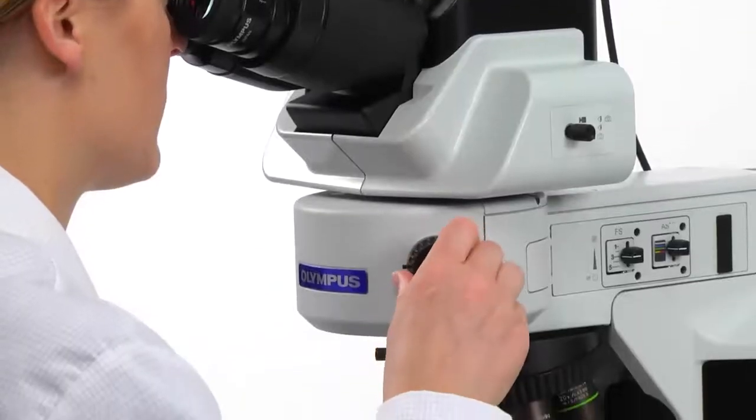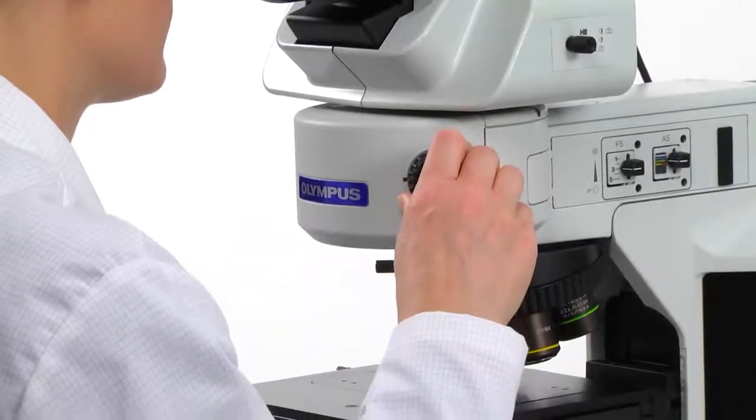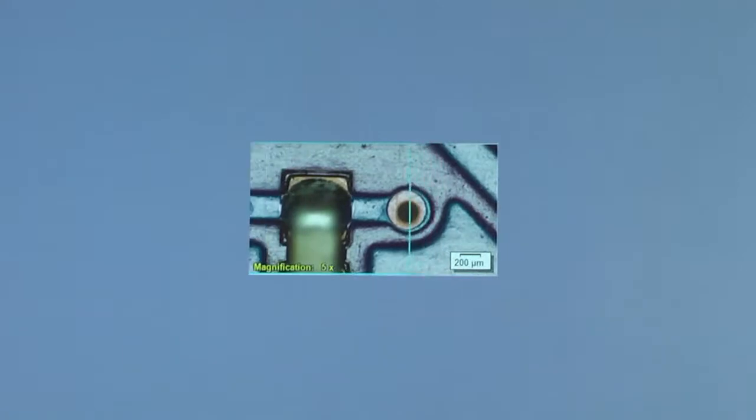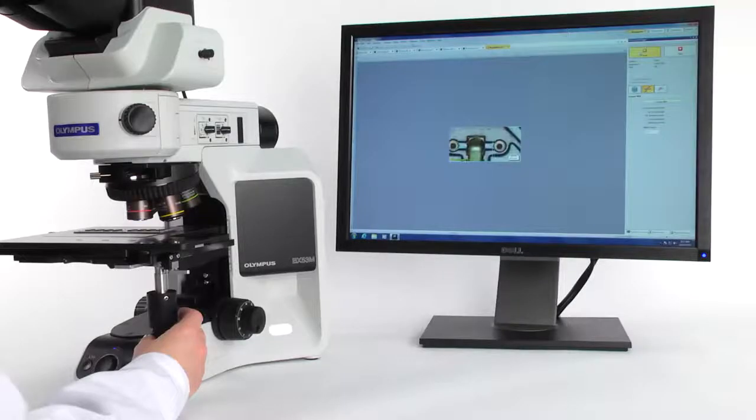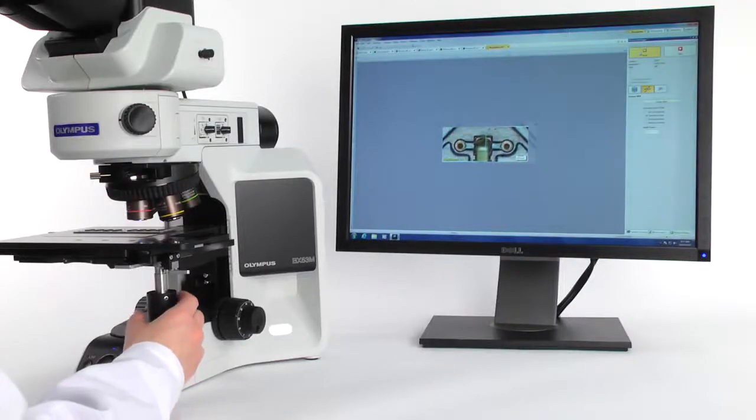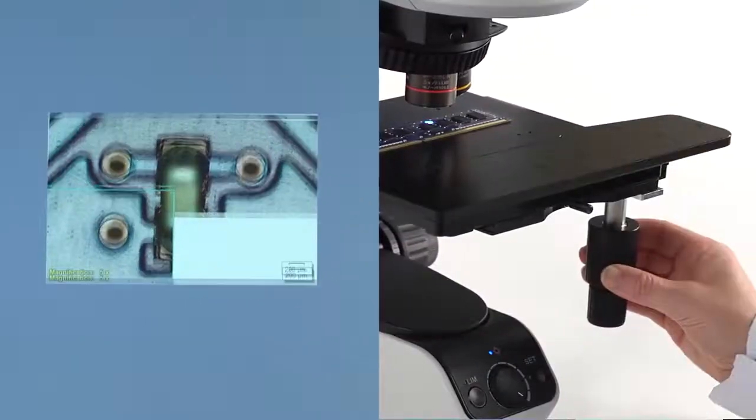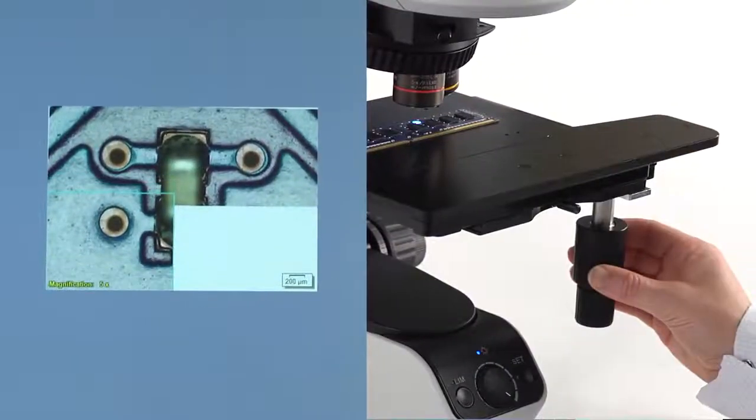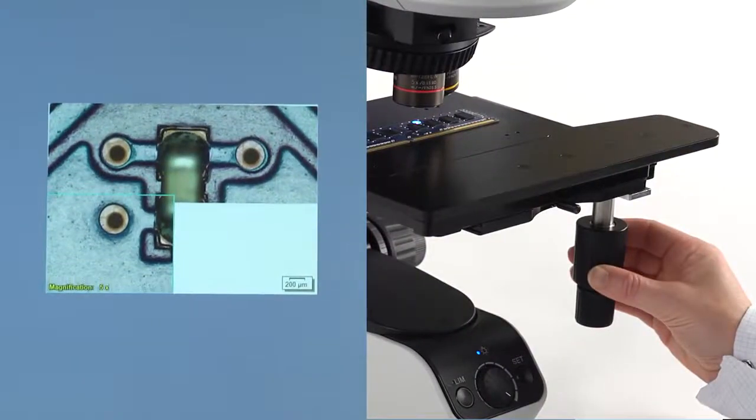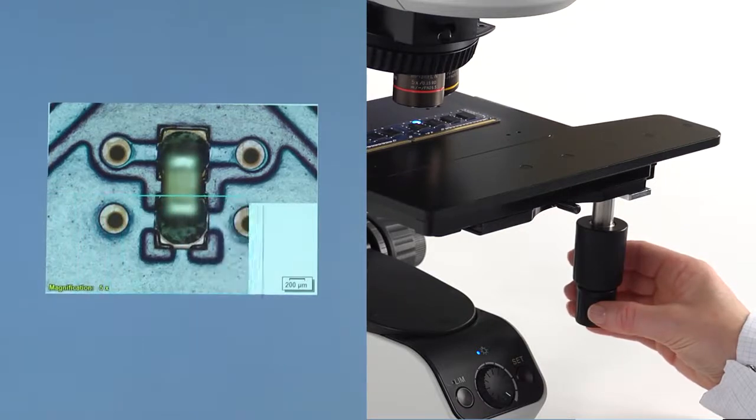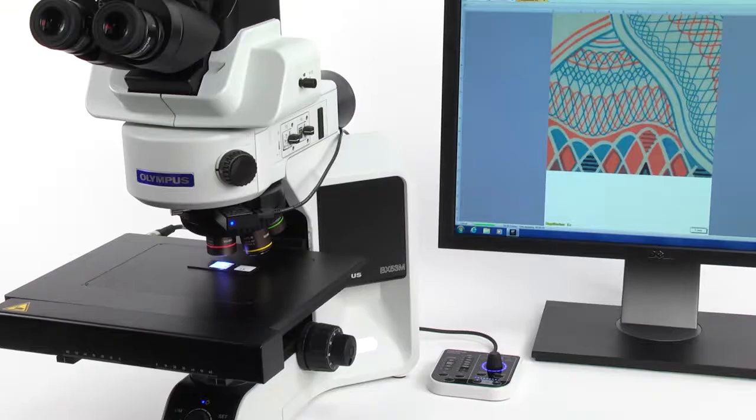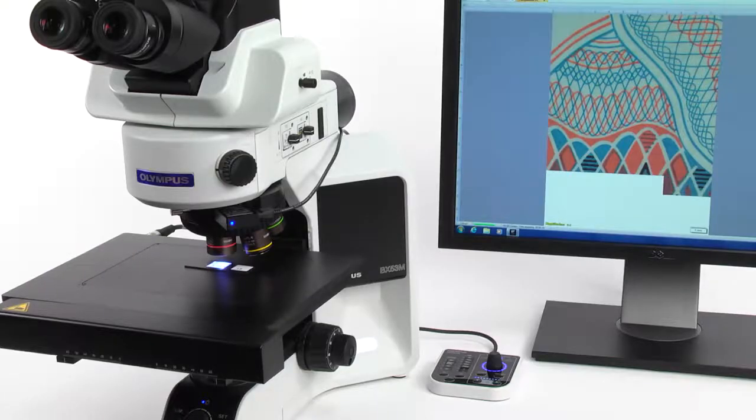Panoramic imaging expands the field of view when the region of interest exceeds that of a single magnified image. Creating a panoramic image with Instant Multiple Image Alignment, or Instant MIA, is now possible by simply moving the knobs on the stage. When a motorized stage is used, an overview map enables easy navigation of the sample.